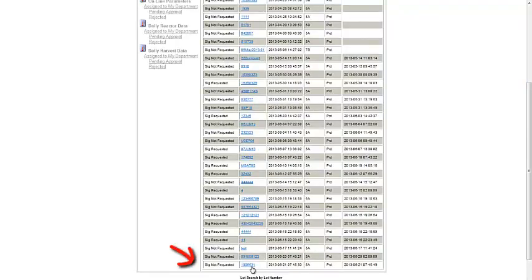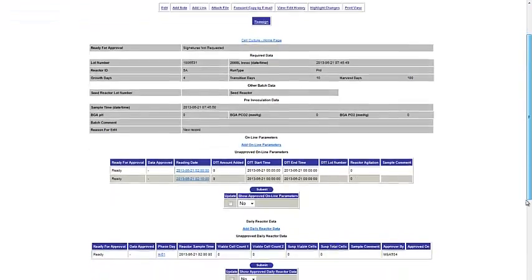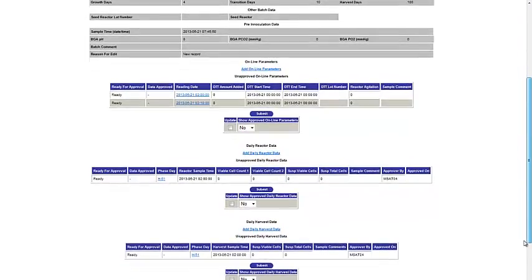However, I could just as easily have clicked on any of the queries on the left side of this homepage. Once on the cell culture main batch record that I need, I can see that all the subtasks are ready for approval. Let's approve them one at a time.